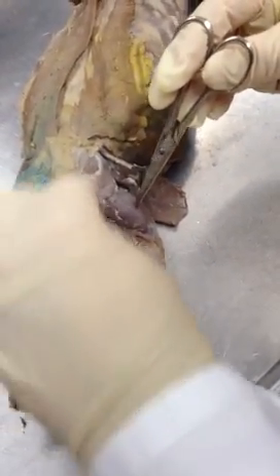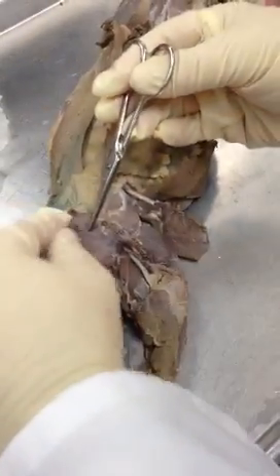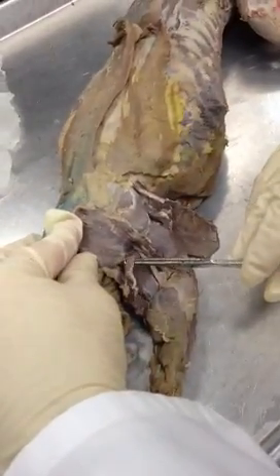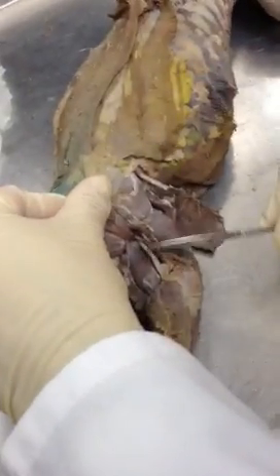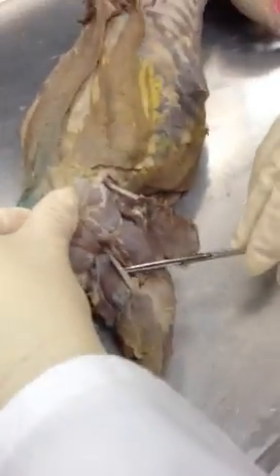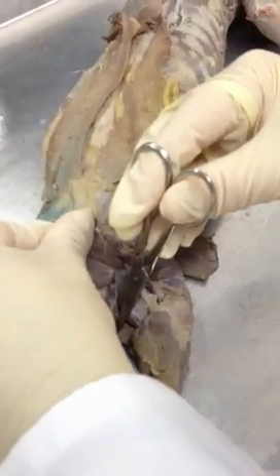Right in here was tensor fasciae latae again. This is vastus lateralis. Then, one pulled back out of the way here — biceps femoris. This is tenuissimus, also cut — I just reflected it back out of the way. Nice big sciatic nerve. The sciatic nerve is right on top of semimembranosus. By the tail, semitendinosus.